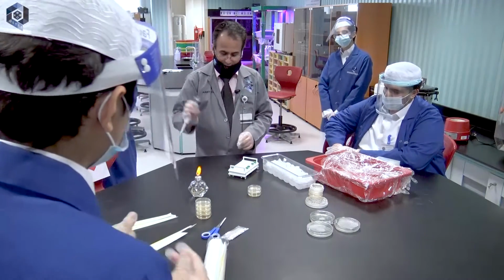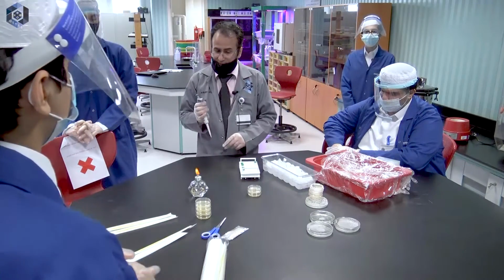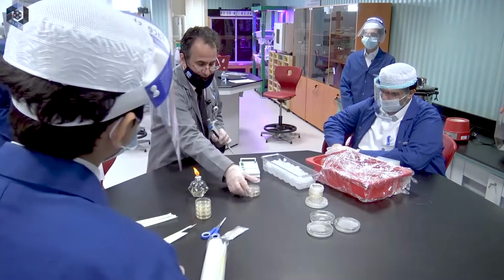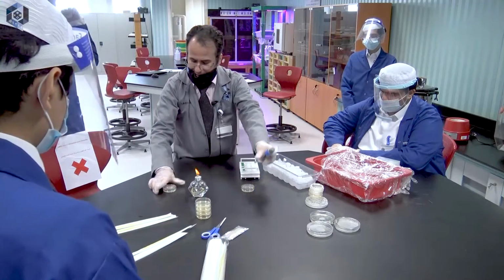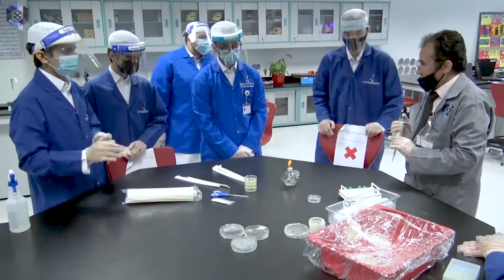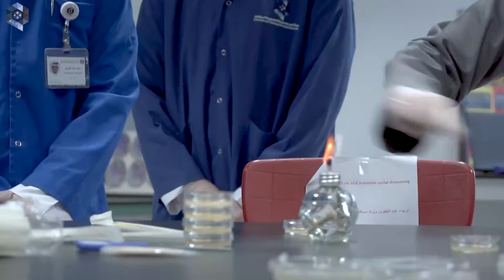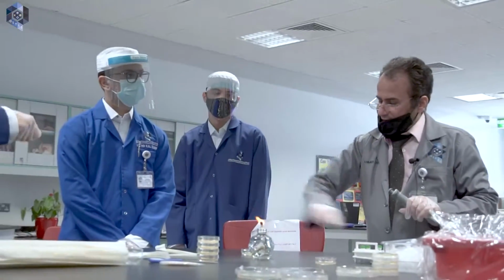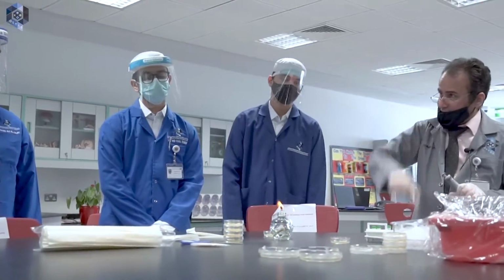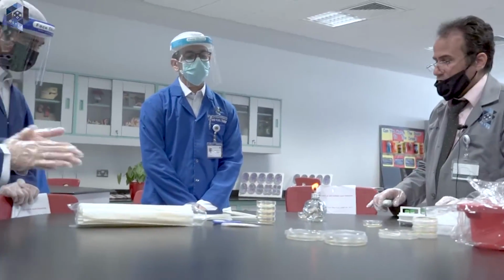You will take 100 microliters from one of these centrifuge tubes. Place it in the middle of the petri dish. Then, using this sterile loop, you will spread it in a net-like form. Yes, like this, like this. But then you will make a net of them, like last time, if you remember. Good. Who wants to start?